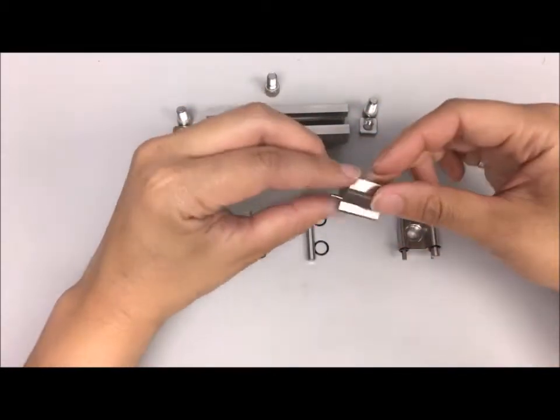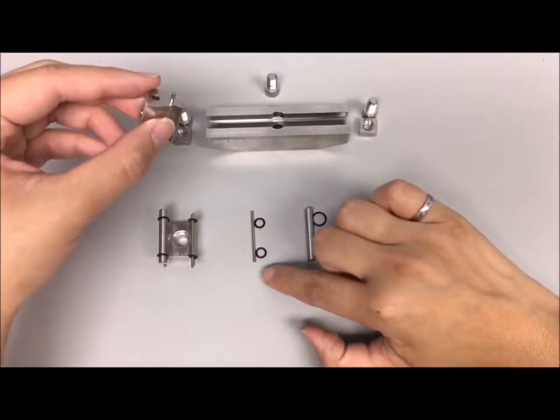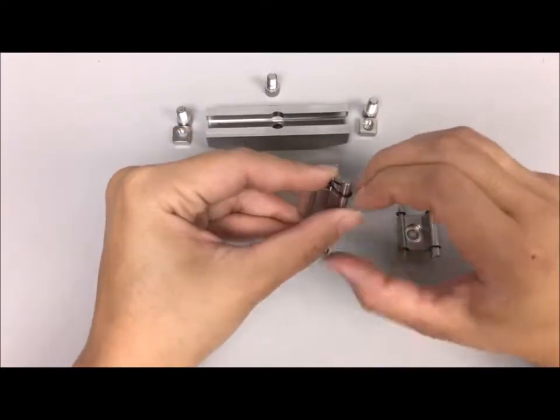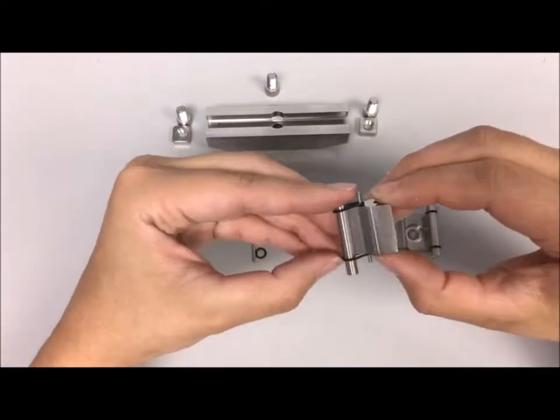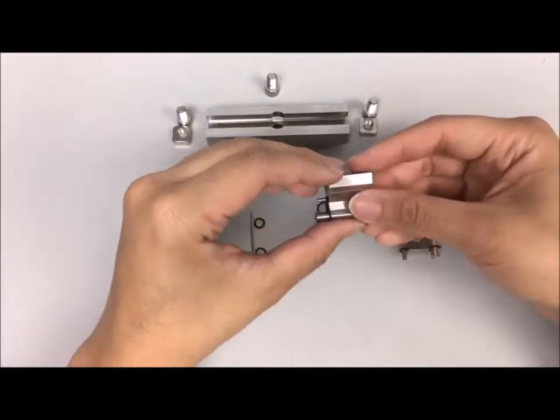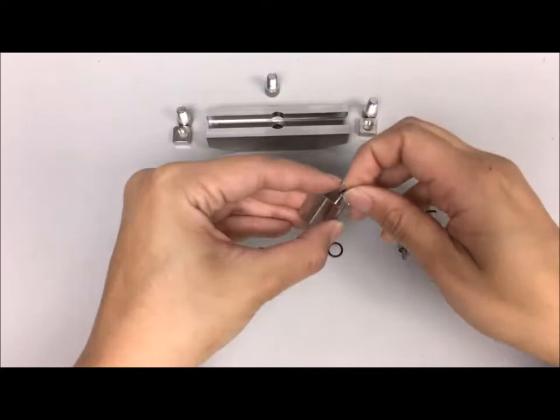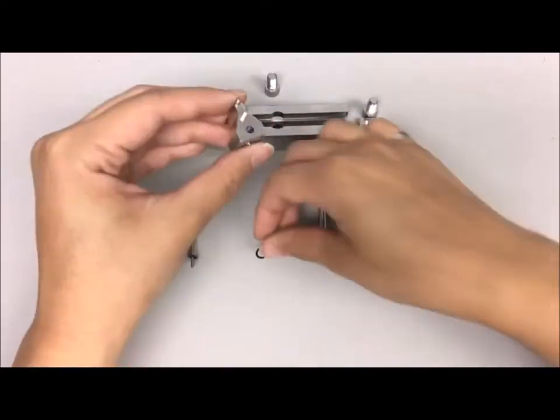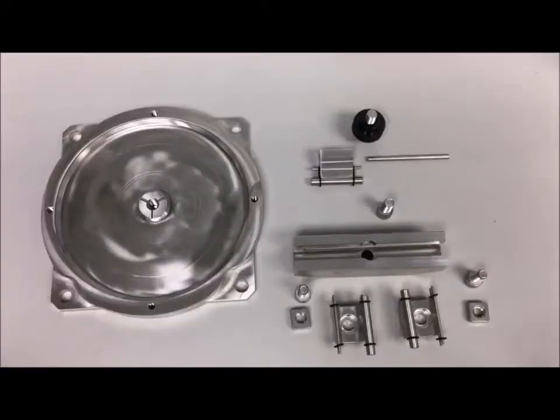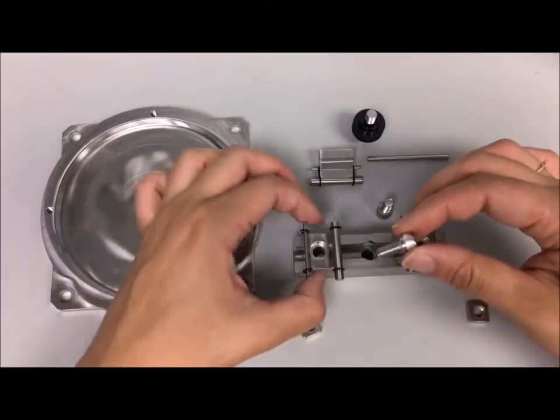Then secure a pin on the three-point bending loading holder. The size of the pin will depend on the sample tested. For example, for an eighth-of-an-inch diameter wood sample or a rat femur, the big pin will be secured on the loading holder. For a smaller diameter wood sample or a mouse femur, the small pin will be secured on the loading holder.